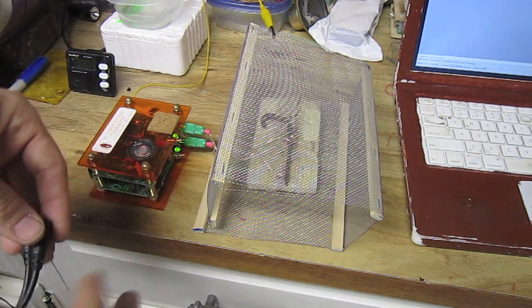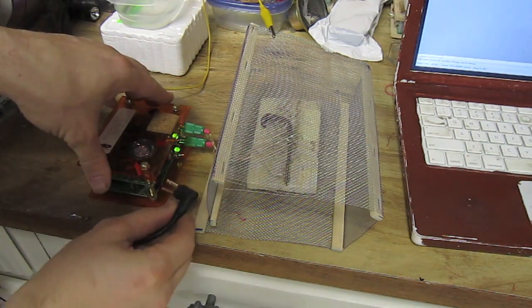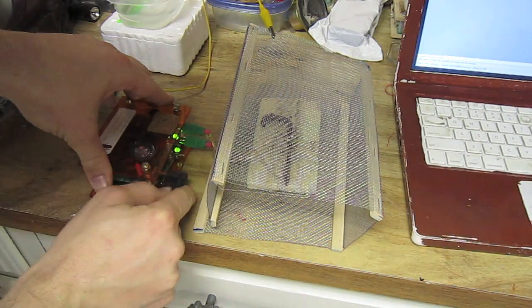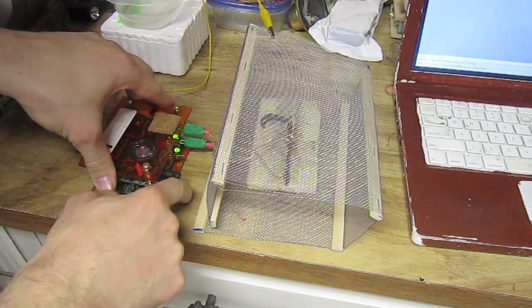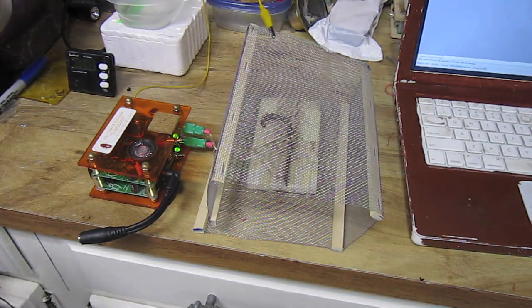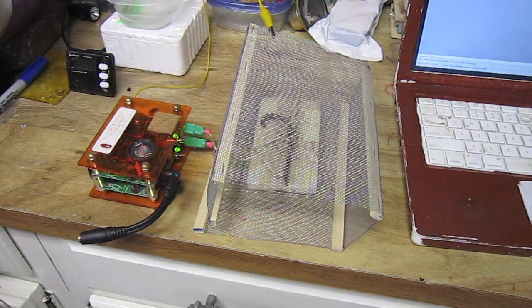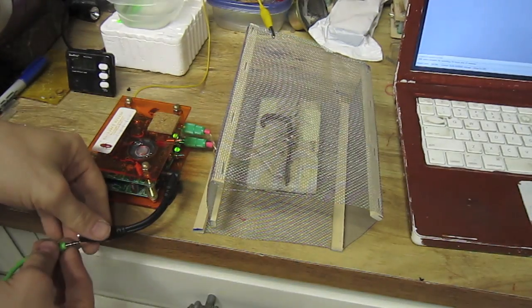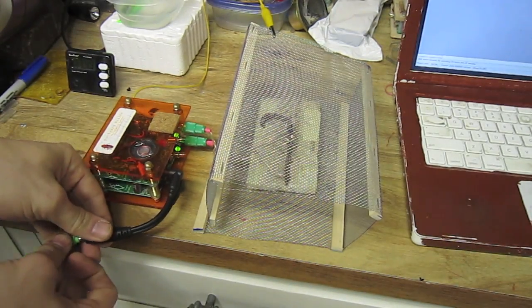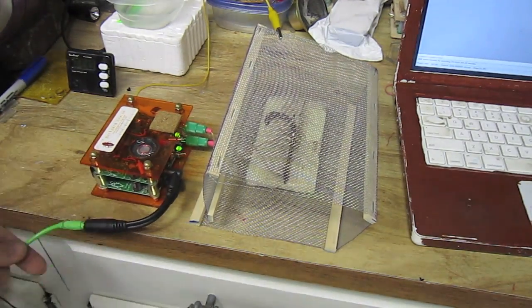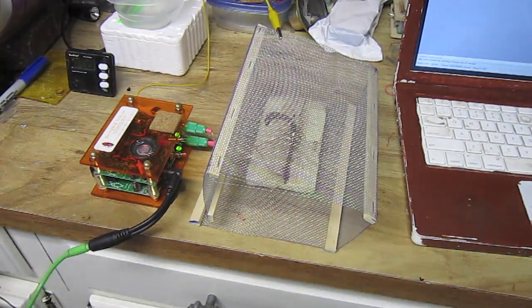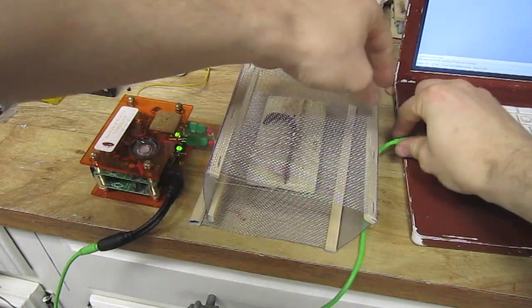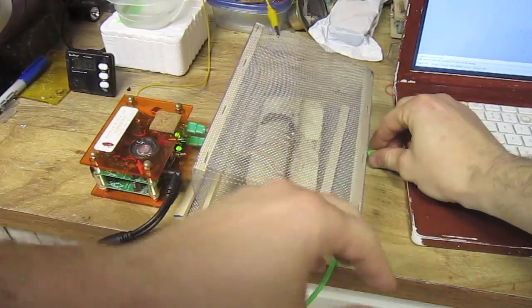Now, the earthworm's nerves are actually myelinated, so this makes the electrical signals we are recording much smaller than we are used to than with our cockroach experiments. In addition, the earthworm is a terrific antenna for electrical noise, so we have to enclose the earthworm in a metal mesh called a Faraday cage.